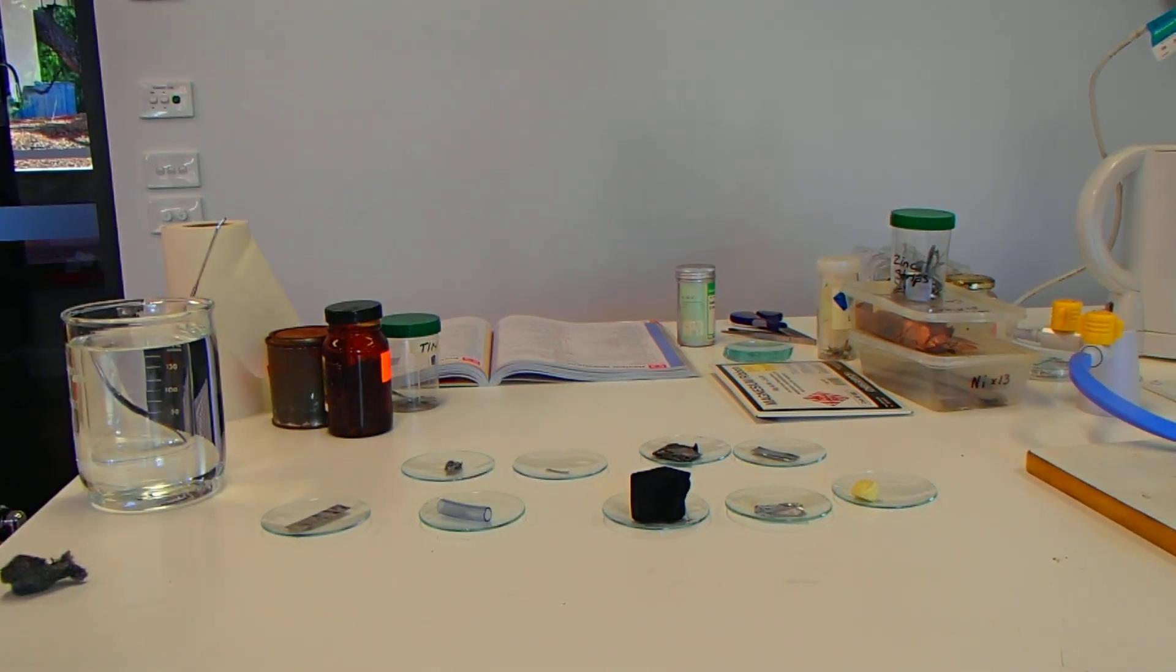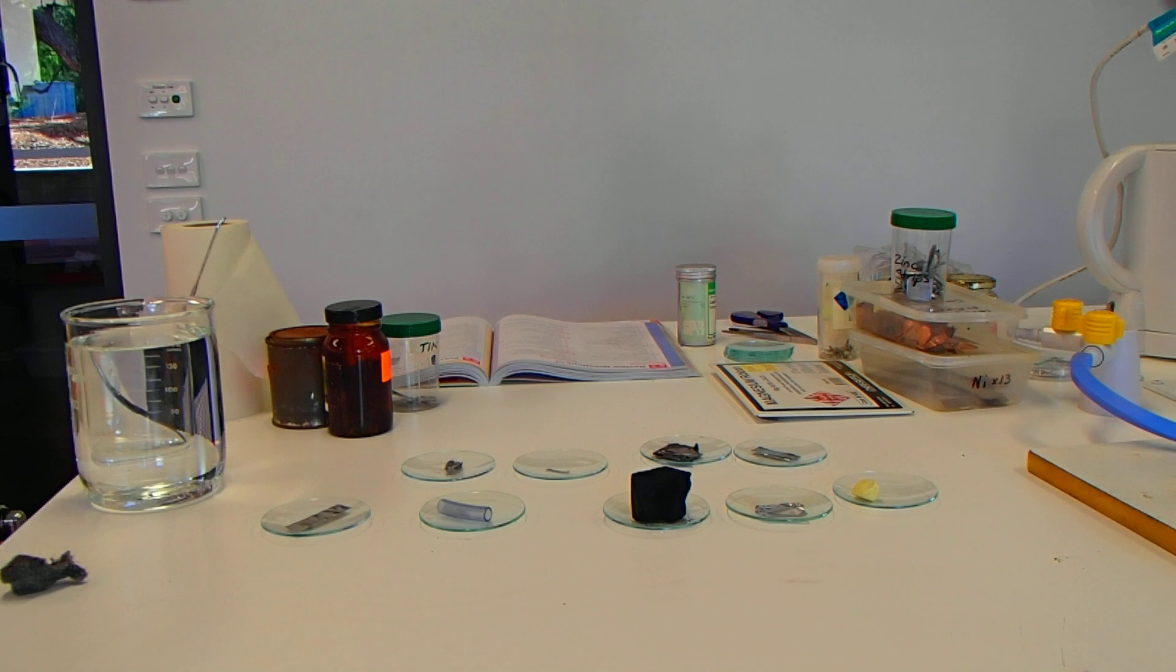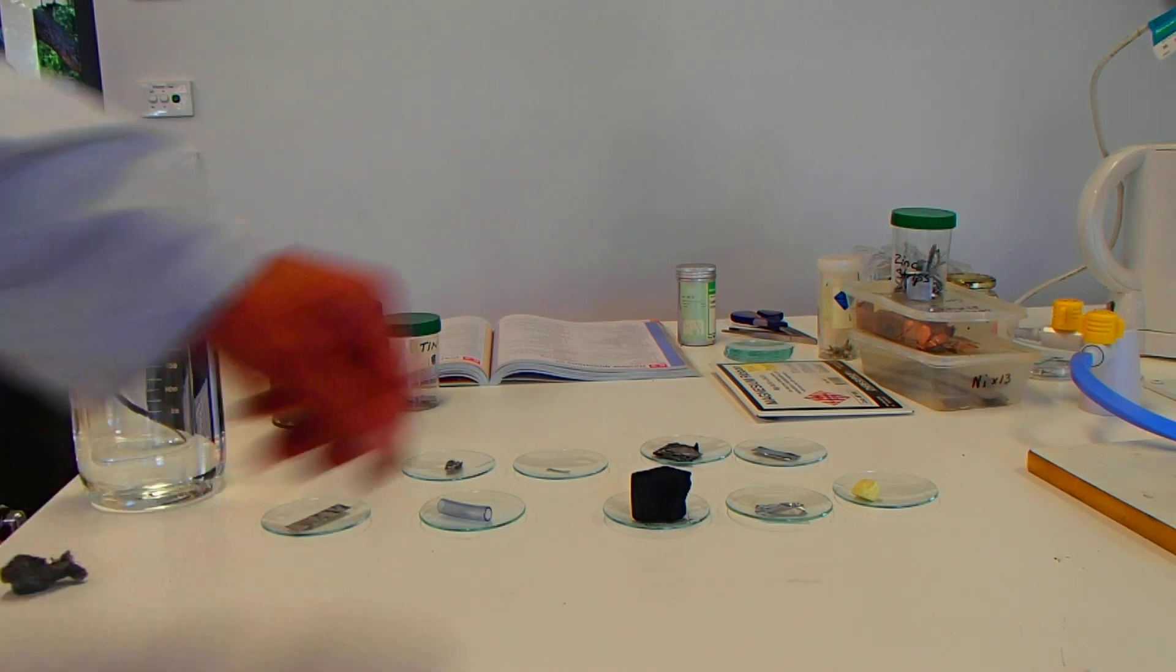Hello again. Now we're on to Activity 5.2, Properties of the Elements. We're going to be looking at the strength of all of these samples, and I'm going to try and bend or crumple them.